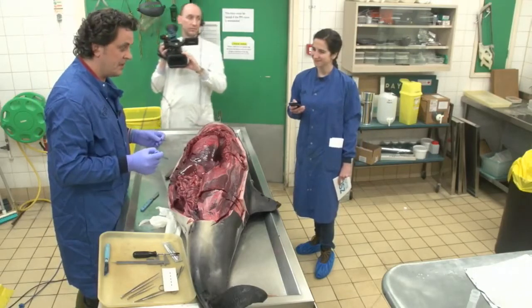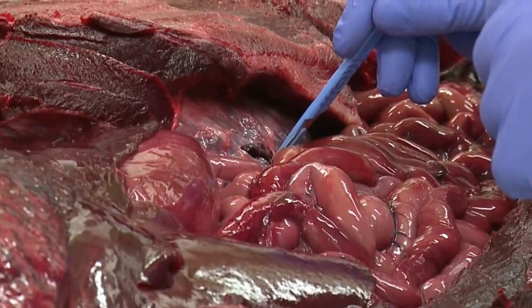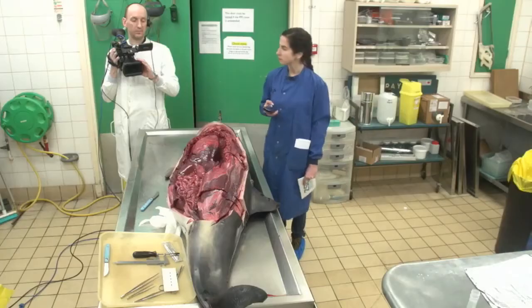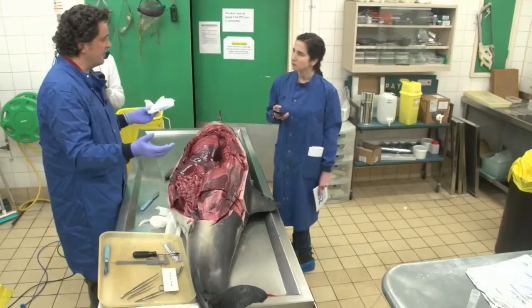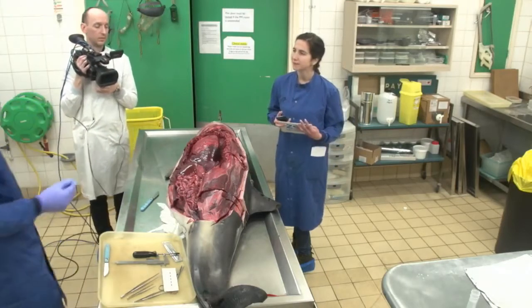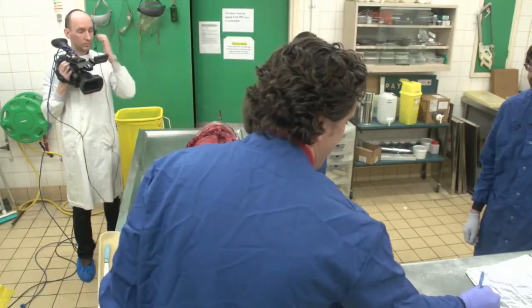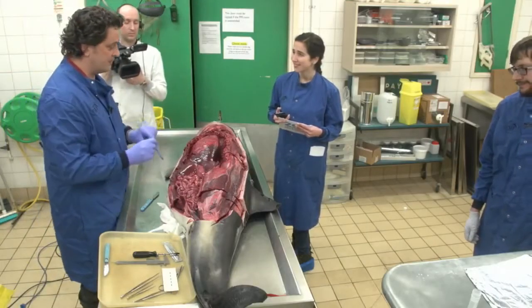Okay, so we're waiting. We'll just do the kidney next, Matt. As I say, even though we have a fairly clear idea of what's going on, we will routinely take these samples in case something comes back, because you never know what you're going to find. Some of the bacteria we culture are unique to science, because there's a group of these animals involved in the marine environment. We've seen a range of bacteria that other animals get too, but also some that are pretty unique. That's part of the attraction of doing this work, to be honest. Even though Matt and I have been doing it for 20 years, seen thousands of postmortems, there are still things that are absolutely unique to science, and you never know what you're going to find until you open the animal up. Must make it very exciting.